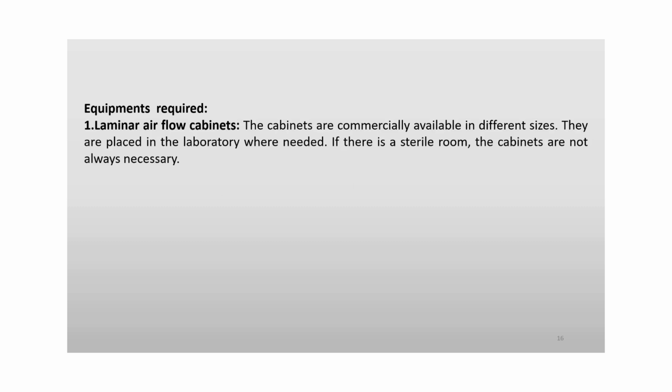Equipment required, especially, first we are going to discuss the small definitions. Laminar airflow cabinet, which you know. The cabinets are commercially available in different sizes. They are placed in the laboratory where needed. If there is a sterile room, the cabinets are not always necessary. Autoclaves in different sizes are commercially available.